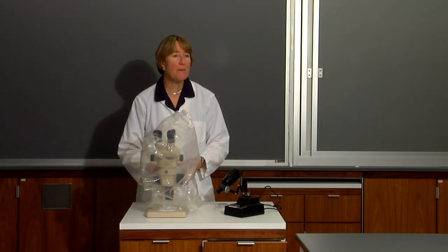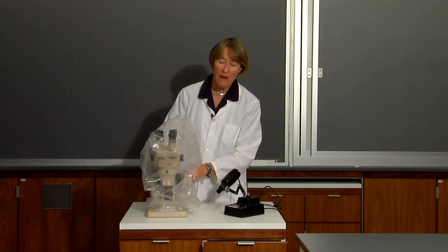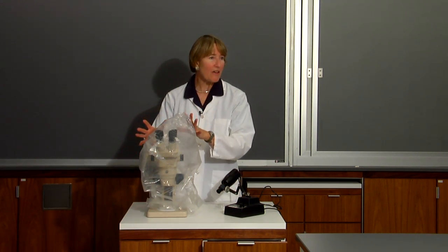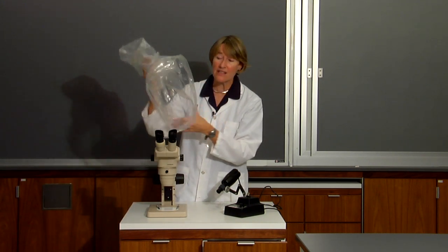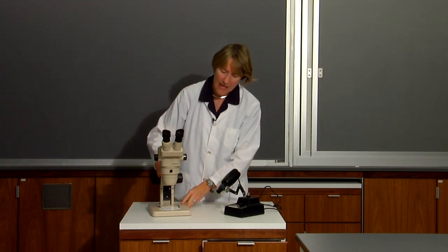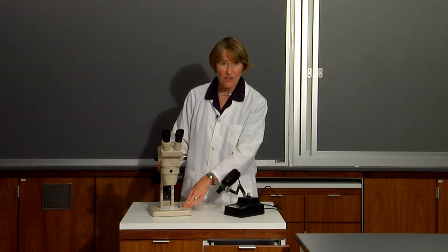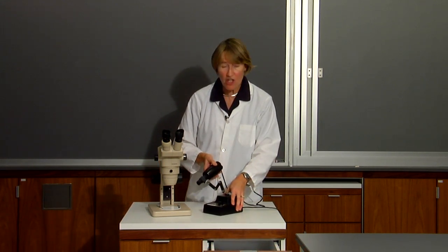We have two different types of microscopes in the laboratory. We have an older version, an Olympus microscope, and all of our microscopes will be covered with a plastic cover which you can remove. That's to keep dust out because these are very expensive pieces of equipment. This older version does not have an internal light source, so you'll have to use an external light source, but it works just fine.